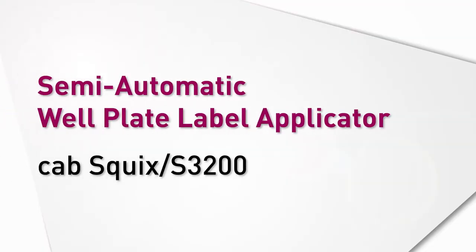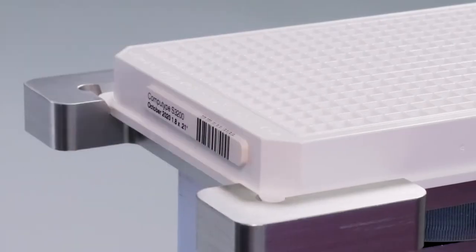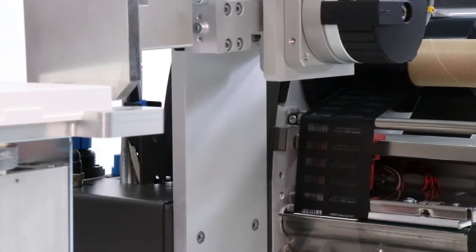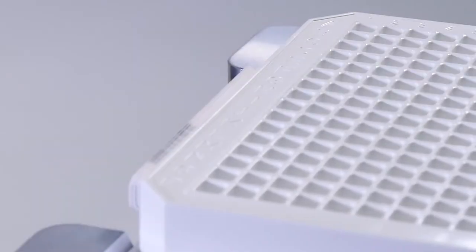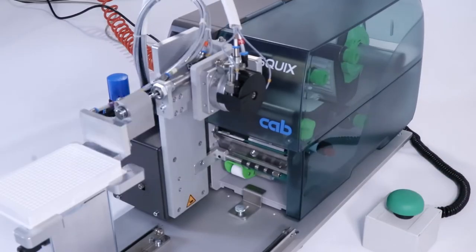This is a semi-automated well plate label applicator which has been specially configured by our engineering team using high-quality components from CAB. Each unit is then tailored to fit specific label needs. So if you are still labeling your well plates by hand, this is an affordable, reliable solution which can significantly improve accuracy and efficiency.